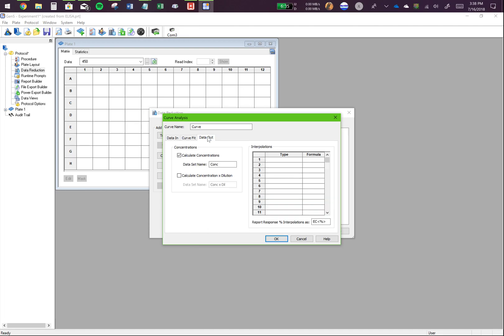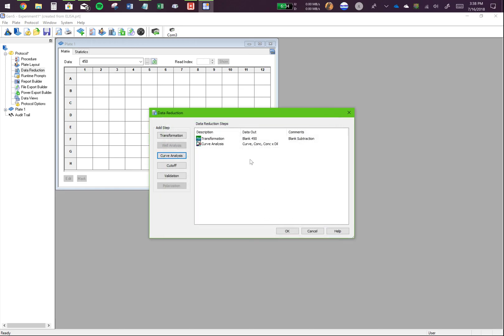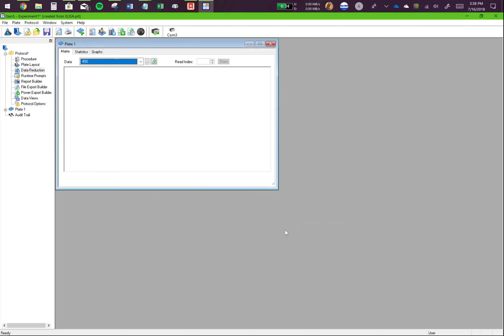Click on data out. In data out, you will click on calculate concentration into dilution. This is very important. Please make sure you have this checked on. And click on OK. Now you have made your curve analysis. This will tell the program how to use the standard curve to find out the unknowns.